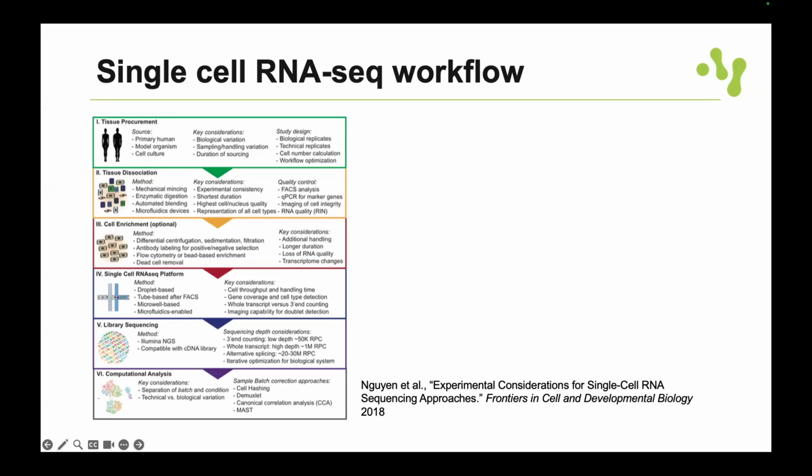So you choose what you do for sequencing, and you also need to decide how much to sequence. Do I need very detailed sequencing to look at fine details of the gene expression, like really fine details?